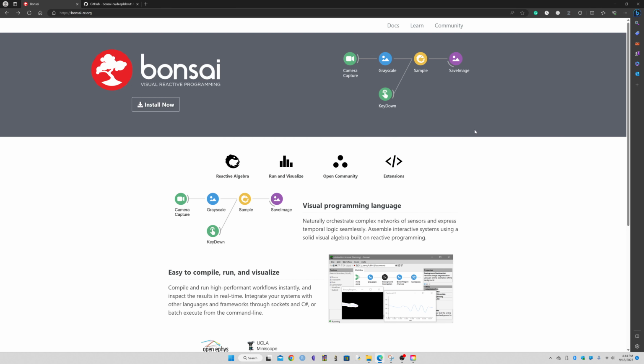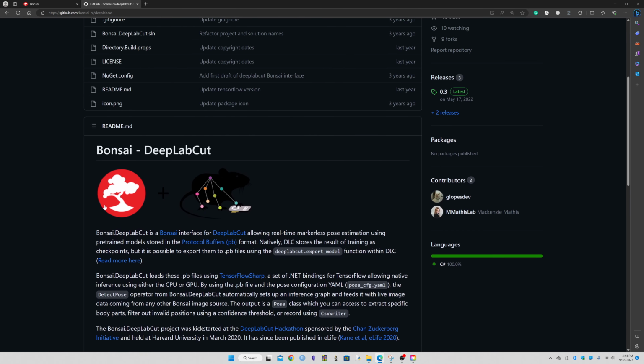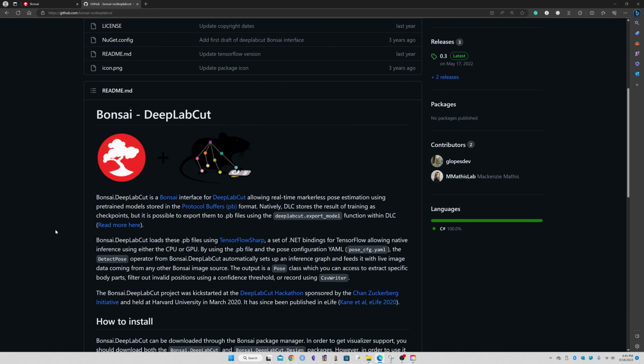Hello everyone. I am here today to talk a little bit about Bonsai and its functionality and integration with DeepLabCut. Now, those of you who are familiar with DeepLabCut, it is a phenomenal tool, allows you to train machine learning, deep learning models to be able to detect different types of poses and to be able to identify different types of animal behaviors in the lab experiments.